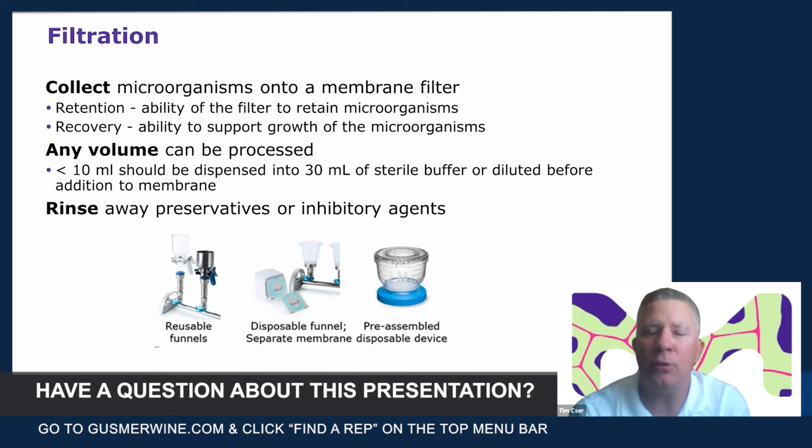But often the matrix of getting through that filter is so difficult that we even use it in sterility testing to capture all organisms. So it's not that they can't sneak through, because they can, but in general, it's better for bioburden because those larger pores in the filter allow the media to come up through the filter and feed the organisms better. And we have a paper that we can show that shows why that works the way that it does.